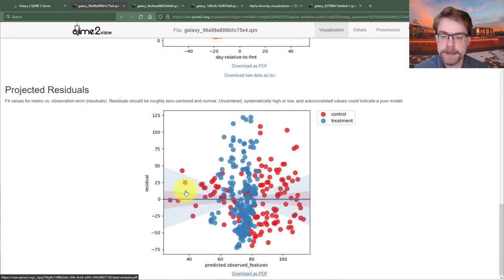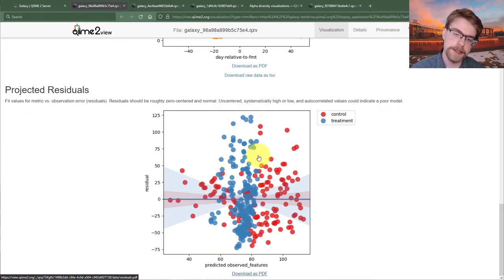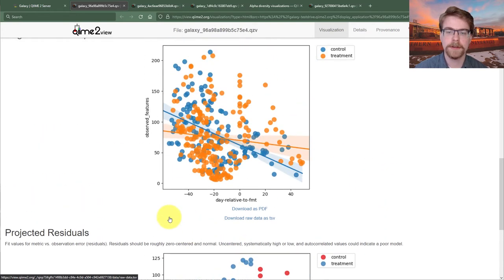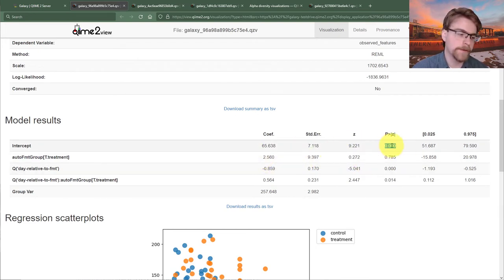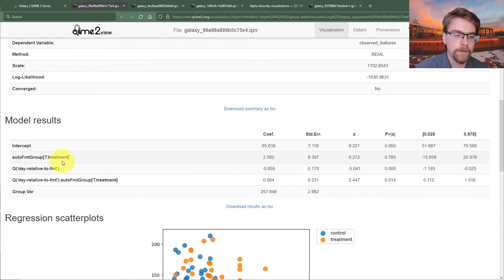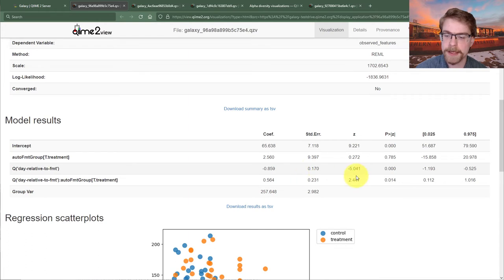Let's have a look at projected residuals first, since that's always important. These pretty much look the same. There might be some concern that treatment falls in a narrow band, but that is also exactly what we're attempting to measure — so we'll keep that in mind. Looking at our model, we see the intercept still matters, but that's uninteresting. Whether treatment was useful is something we might care about, and we see it isn't significant — it's actually deeply not significant.